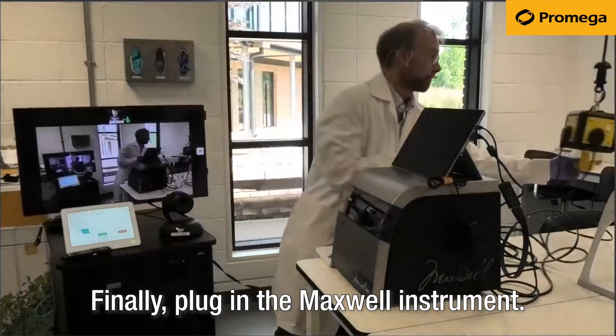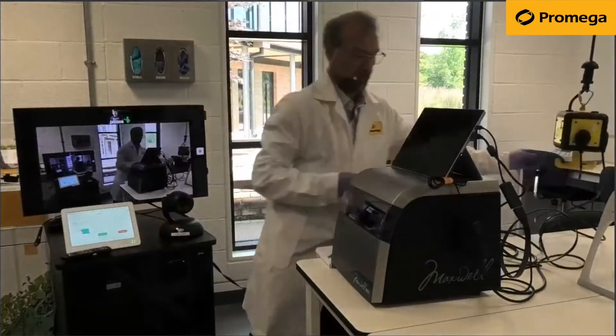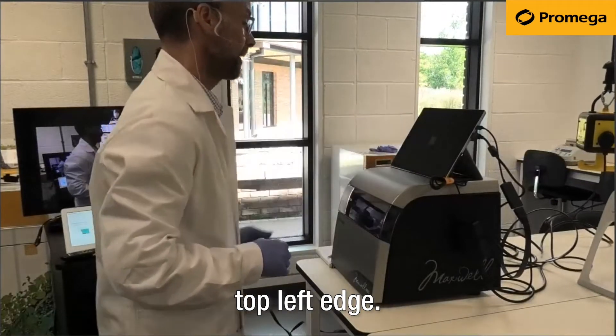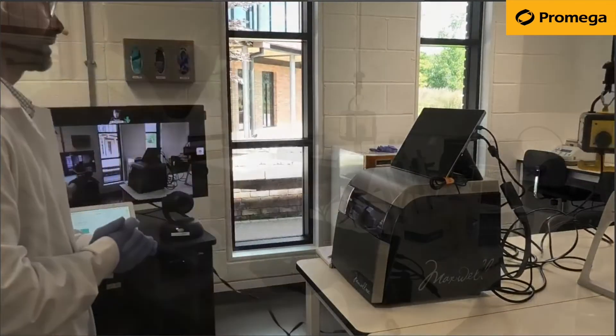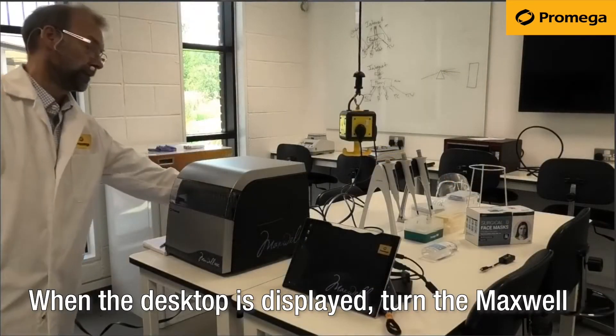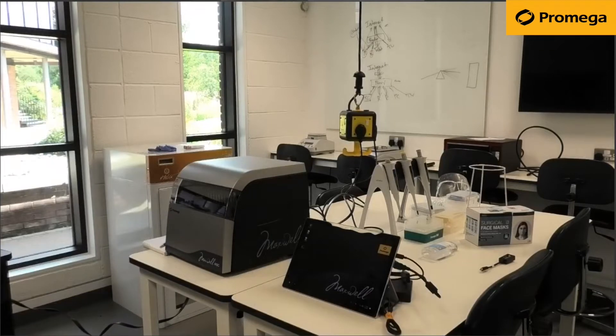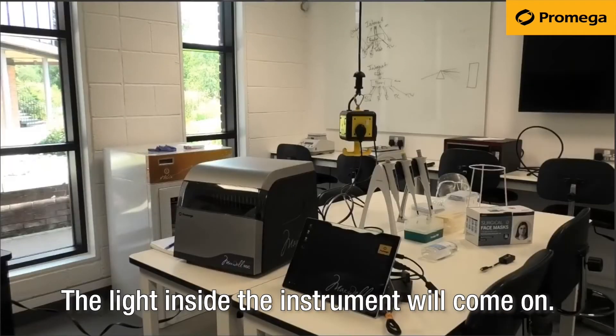Finally, plug in the Maxwell instrument. Turn the tablet on by the power switch on the top left edge. When the desktop is displayed, turn the Maxwell instrument on via the rocker switch on the back. The light inside the instrument will come on.